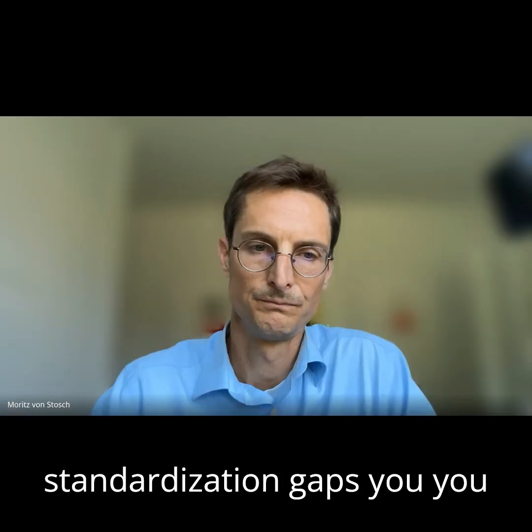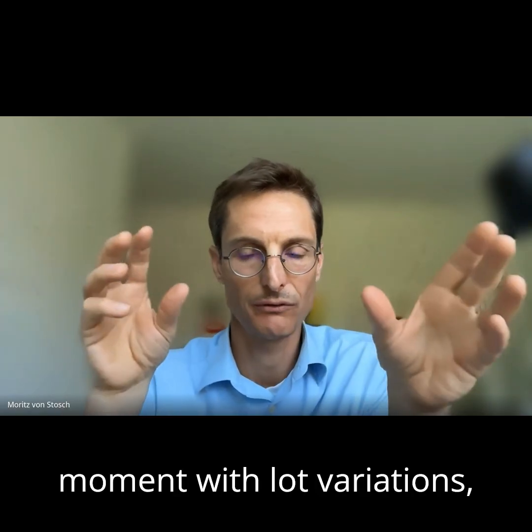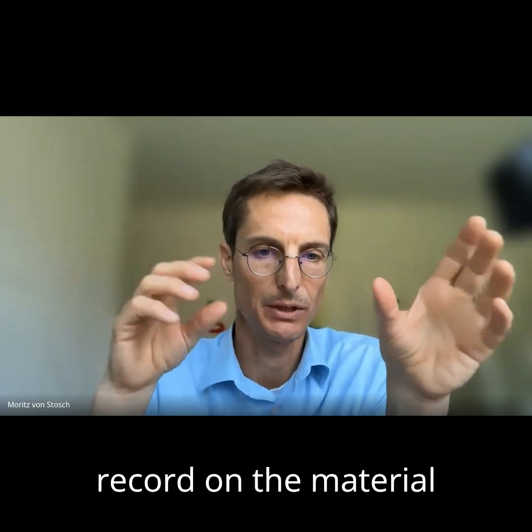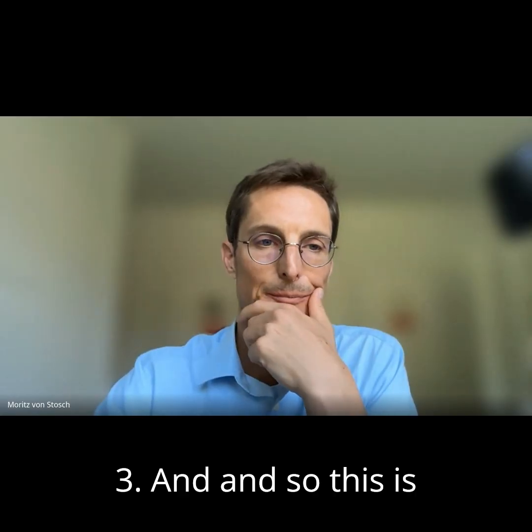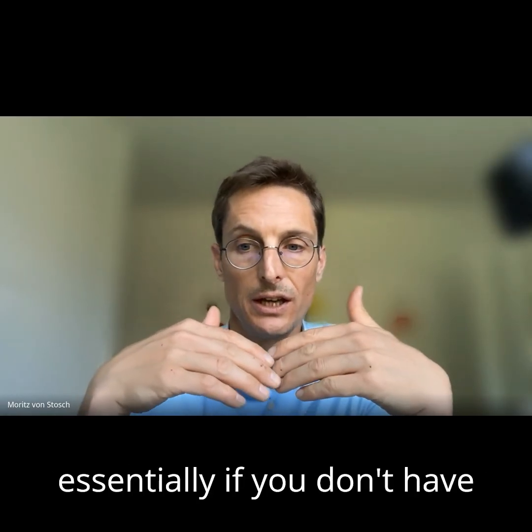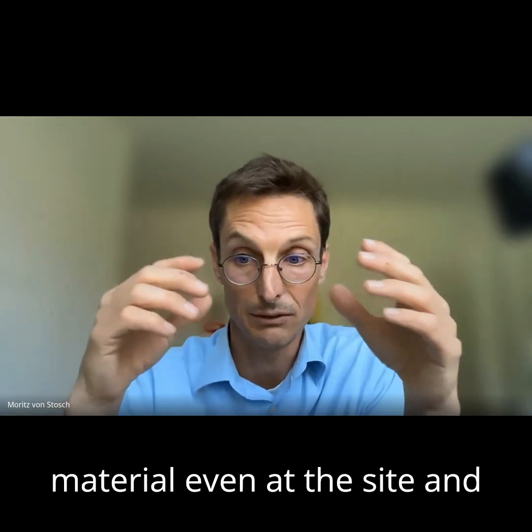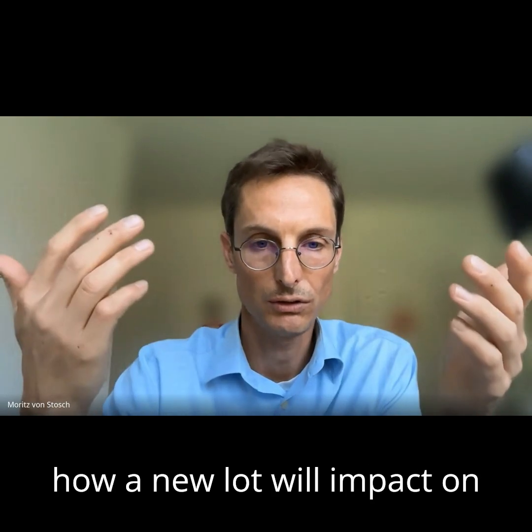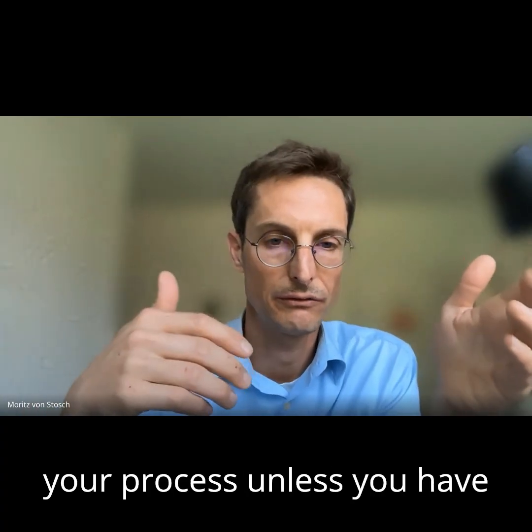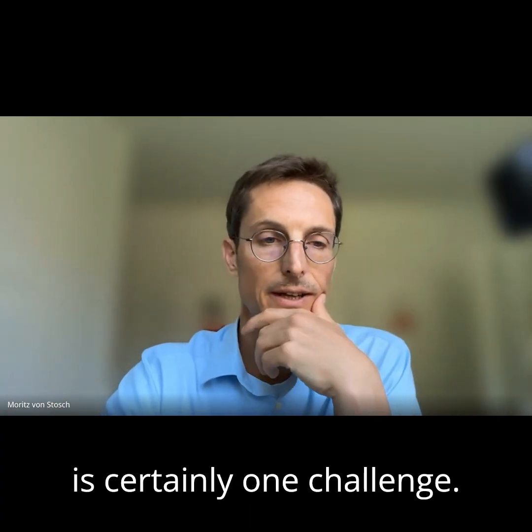Yeah, I mean, standardization gaps, you mentioned it, raw materials, and in particular, we record raw materials mostly at the moment with lot variations, right? There's not a lot we record on the material itself. We just say this is lot 1, this is lot 2, lot 3. And so this is providing a challenge, because essentially, if you don't have the same kind of material across sites, or if you don't have the same kind of material even at the site, and you might have variations in lot, you don't understand how a new lot will impact on your process unless you have run 1 or 2 runs with this new lot, right? Then that is certainly one challenge.